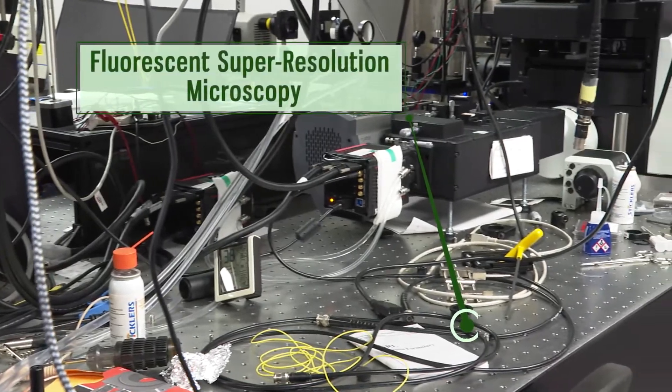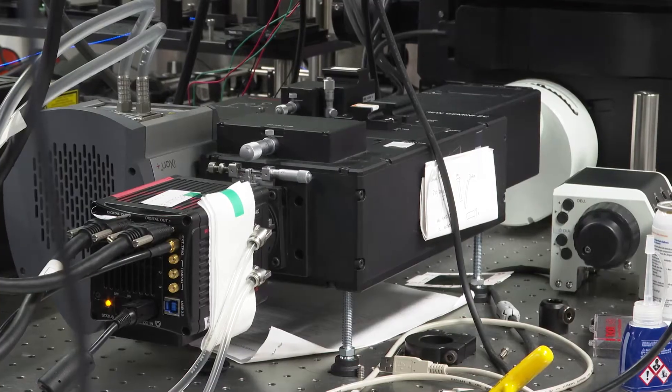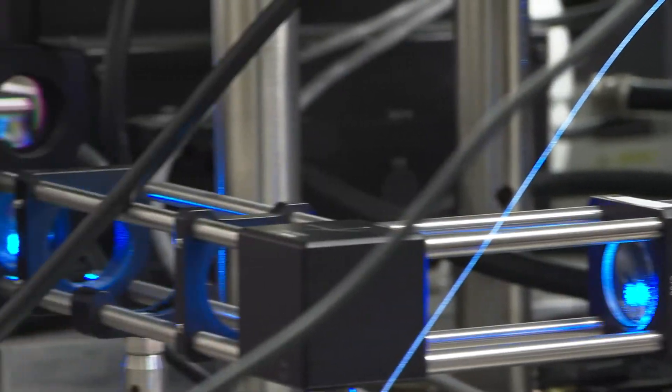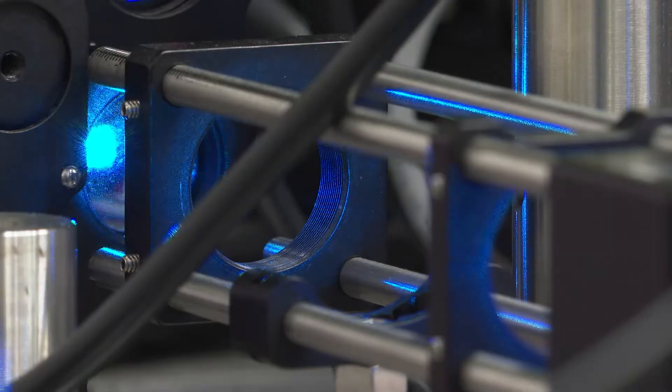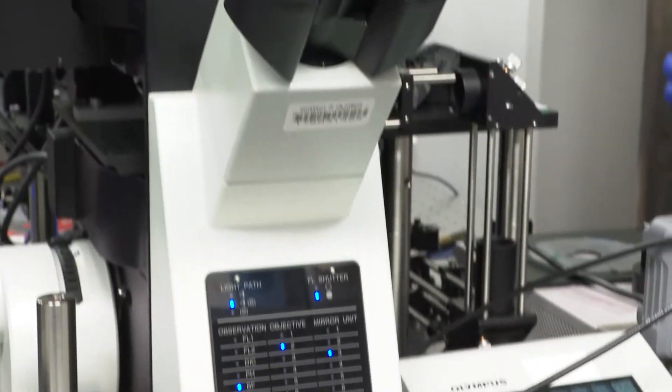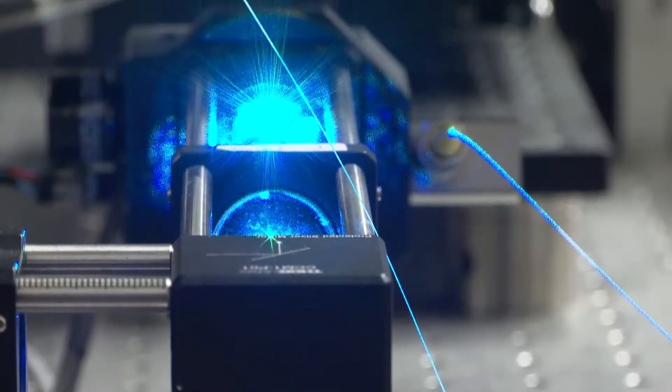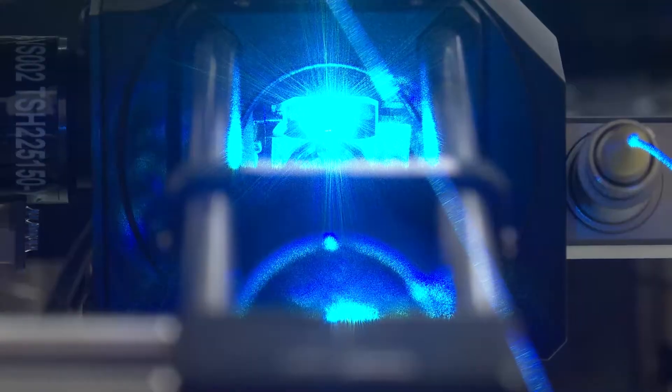This station is a custom-built imaging setup for fluorescent super-resolution microscopy. The custom optics allow for higher-speed laser scanning of the sample. Combined with specially designed metamaterials, this microscopy technique can improve image resolution by 5-fold compared to diffraction limit with high acquisition speed.